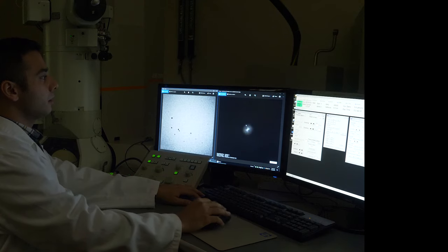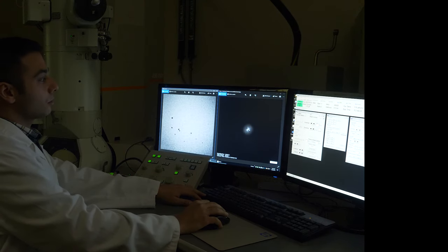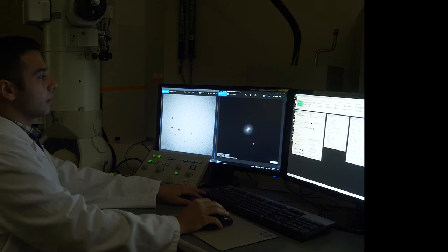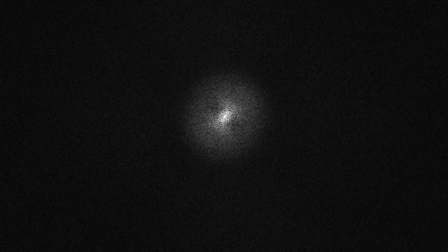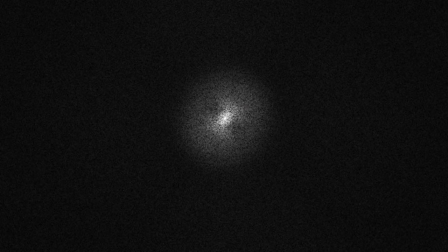Also, the fast Fourier transform, or FFT, show no diffraction, which also shows that these dots are non-crystalline in their structure.